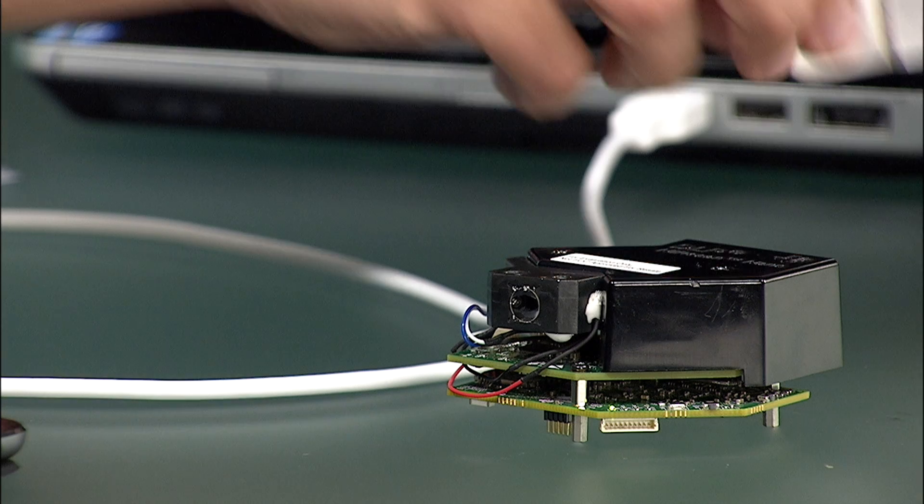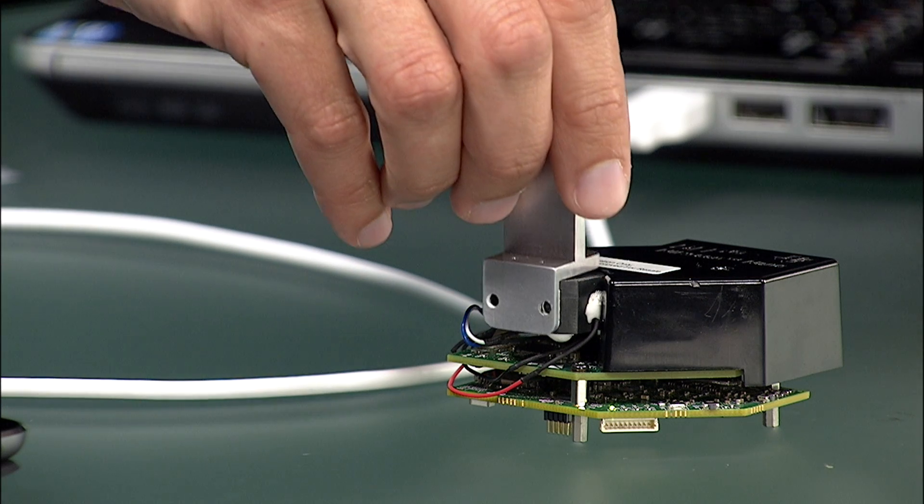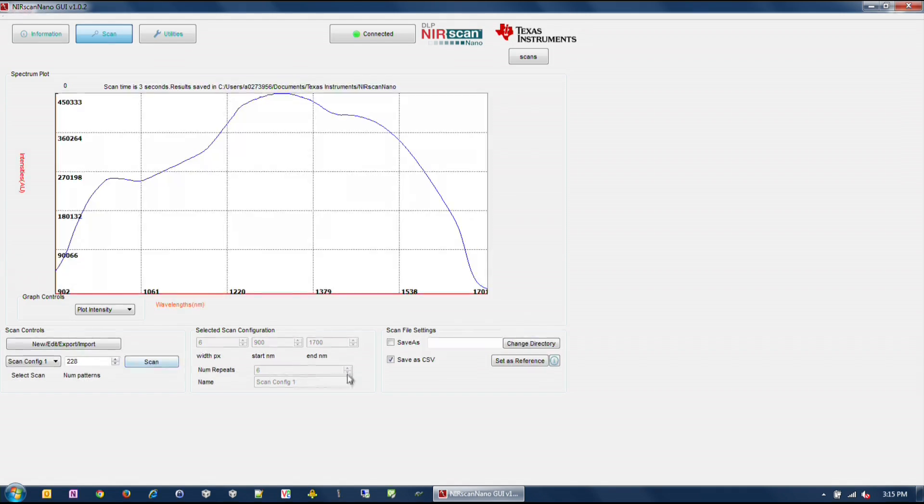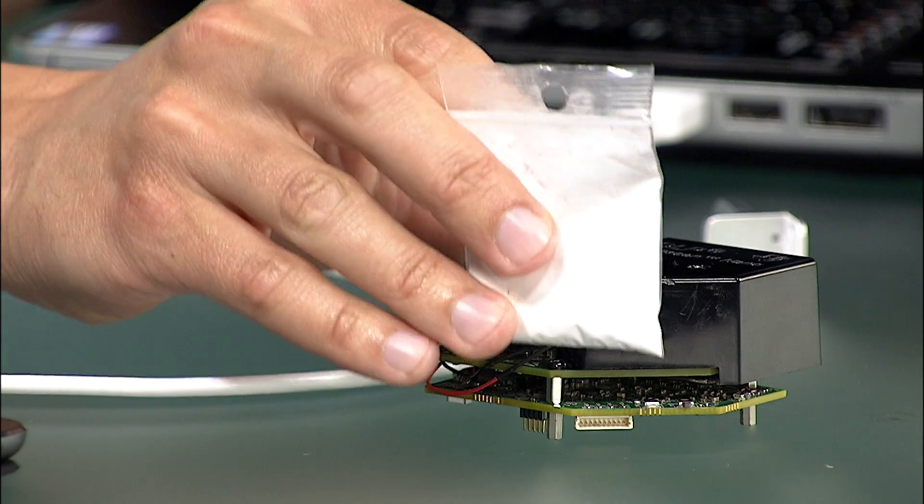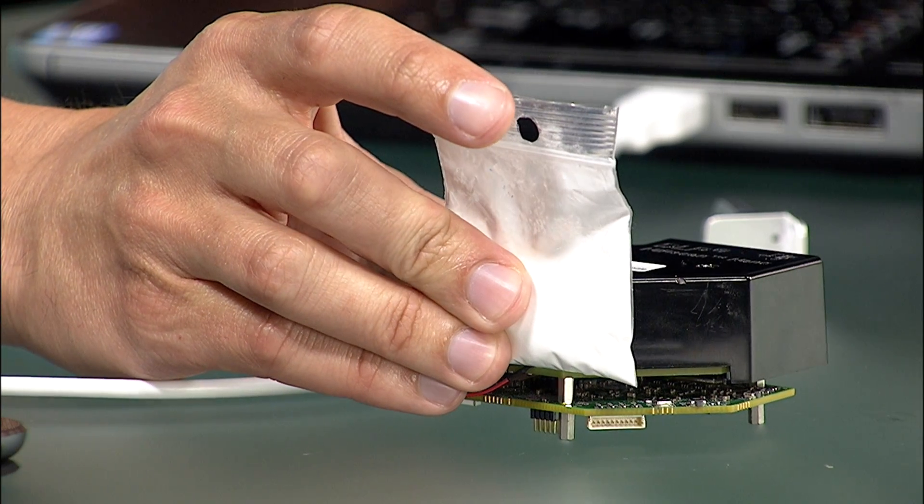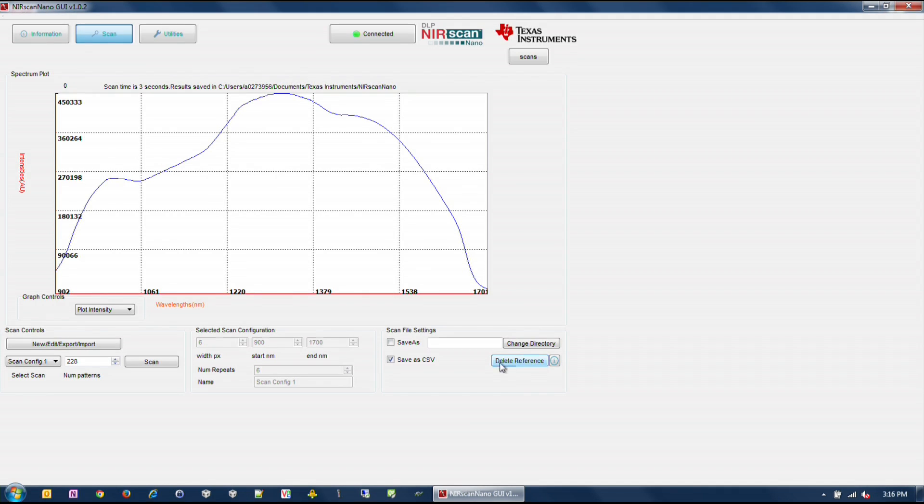Once a scan configuration is selected, define a reference by scanning a reflective reference standard. Then click on the Set Reference button. After these steps, place any material at the sample window and click Scan in the Scan Control section of the GUI. This will display the absorbance plot of that sample.